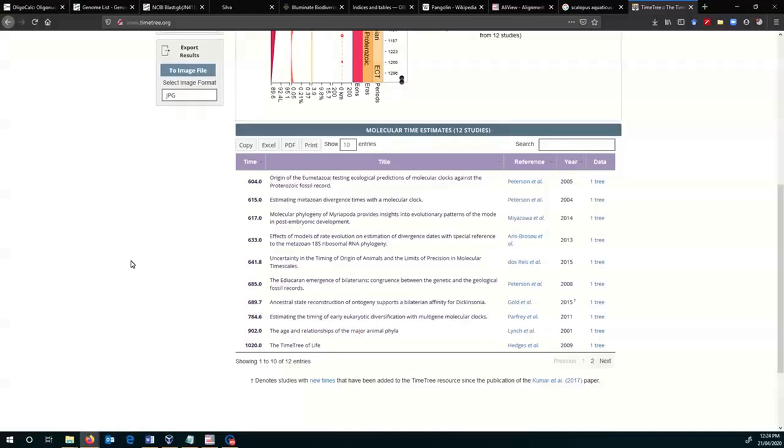To summarize, first thing you should do is do a Google search and see if someone else has done something. If they have, check to see whether it's useful for you as it is. If not, you might be able to modify it, and you can go through some of those steps that I just showed you to modify their information, and that's worthwhile because DNA sequence databases are often being updated. For a paper like that, the tardigrade one was published 11 years ago. If you redid that primer design, it might be better now because there's more information available.